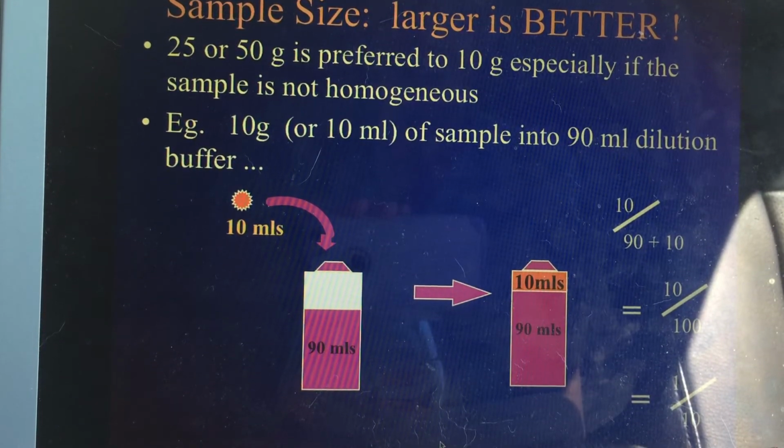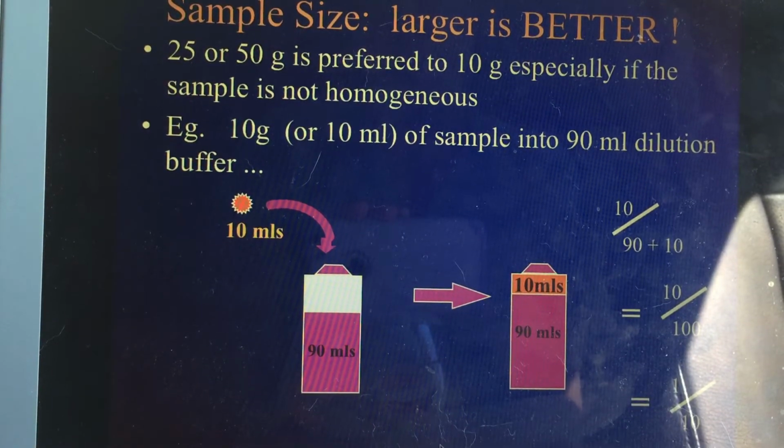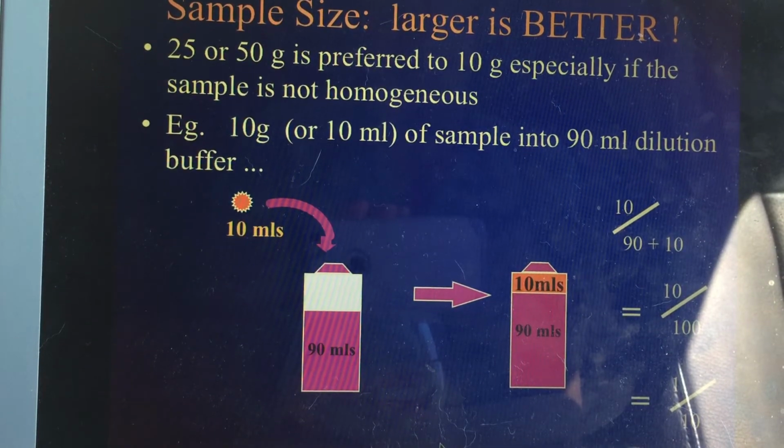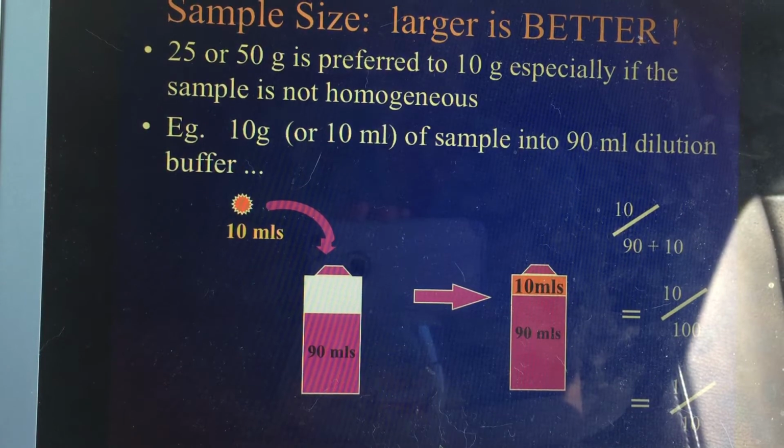In our labs at Centennial, we will commonly use 10 grams. This is a happy in between. There's enough sample size that we can get a good representation of the whole sample, but we're not going to use an excessive amount of media, supplies, and reagents, etc.